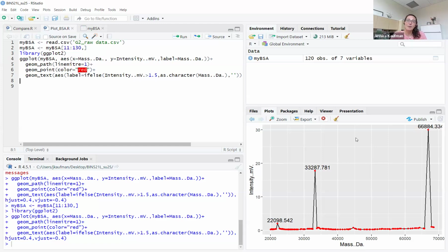And then the last thing I would recommend looking at is themes. One of the big things that can help a graph go from looking like an example in our cookbook to looking like a plot that you would actually put into a research article is just removing that gray background, right? That gray background isn't always the thing that makes it look nicest for an actual publication. You often want a white background or some other background, and so themes are a good way to switch out that look.